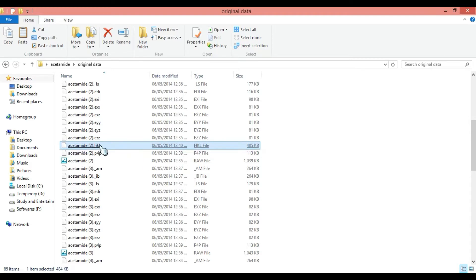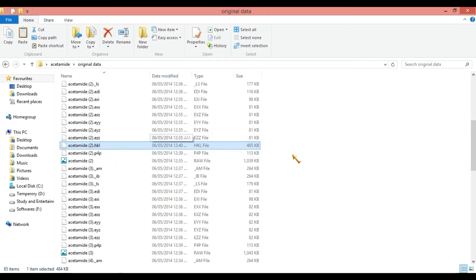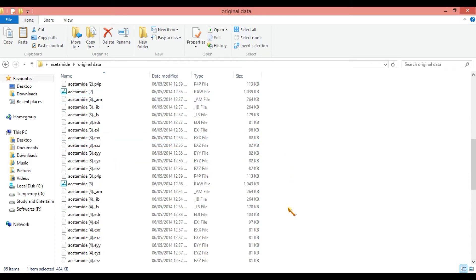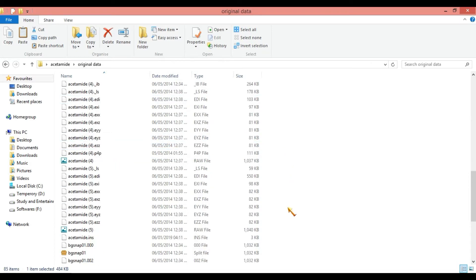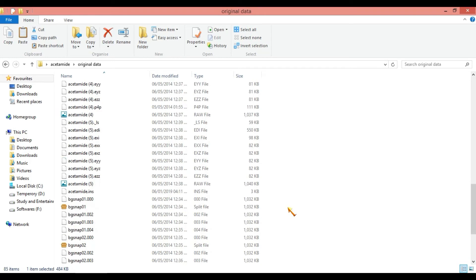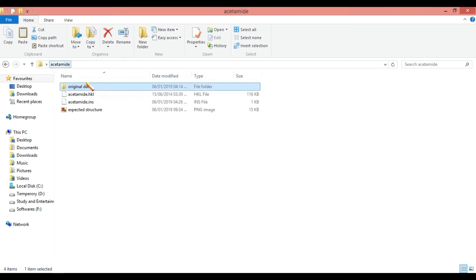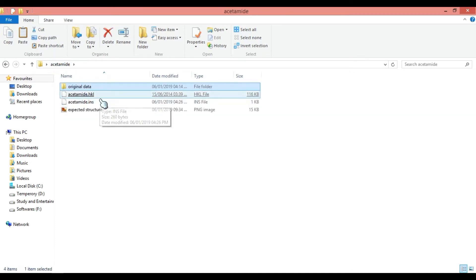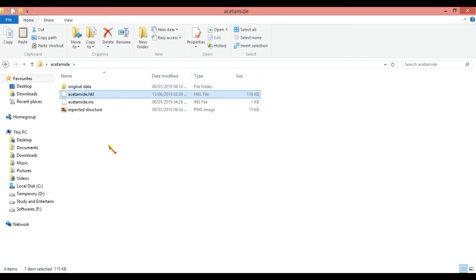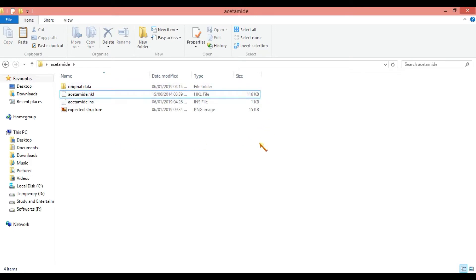The first file is the .hkl file. The .hkl file is a reflection file, and the next file is the .ins file. The .ins is an instruction file. I am copying these two files into another folder. Using these two files, I am going to solve the crystal structure.